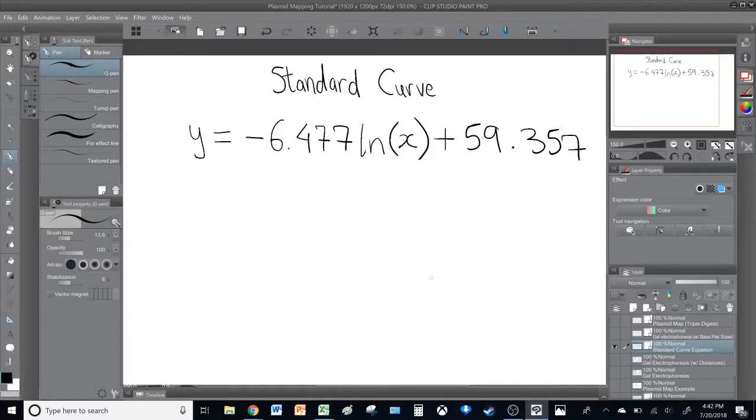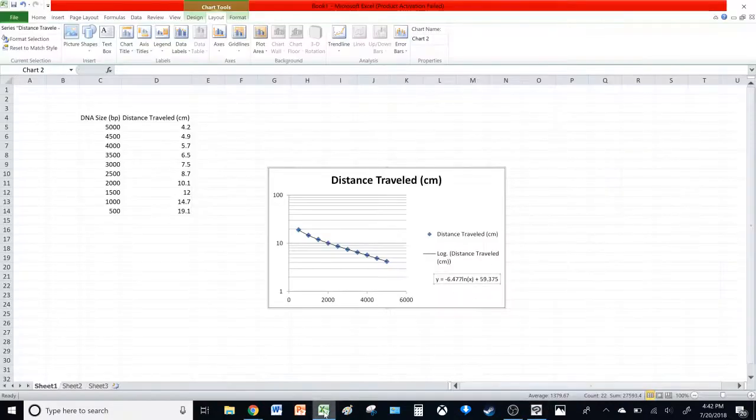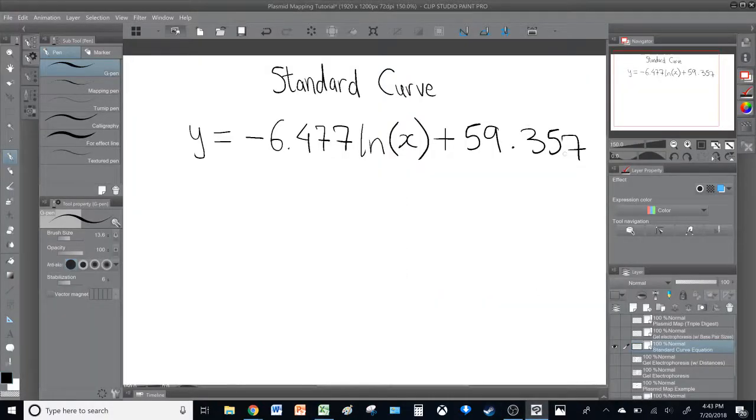Just take a look back to confirm. 59.375, yeah, I thought as much.